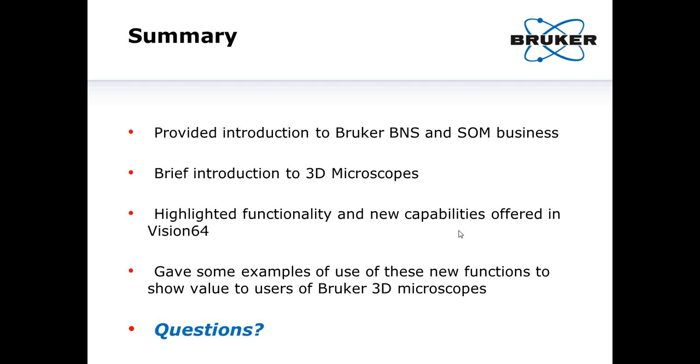We have another question about topography on a surface which is created by thin transparent film. As many people are aware, with a microscope system that's based on white light interferometry, if you have transparent materials that are causing a film step with dissimilar materials, you definitely can, depending on the type of materials, see a difference in the phase that comes from those, and therefore you have an offset in the height of the data that you see.